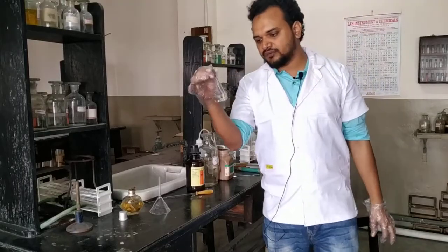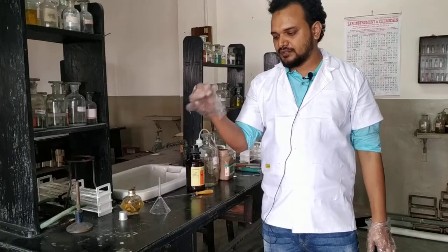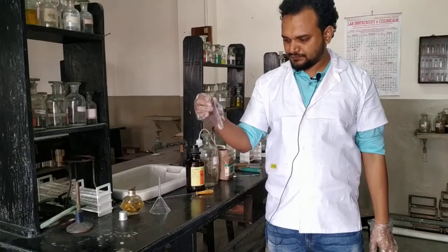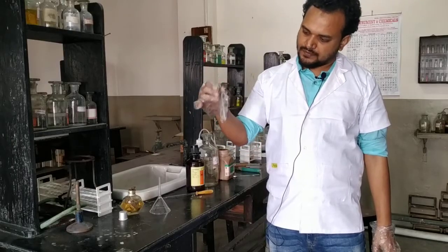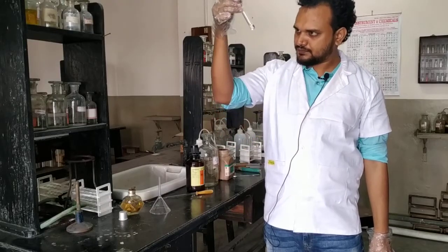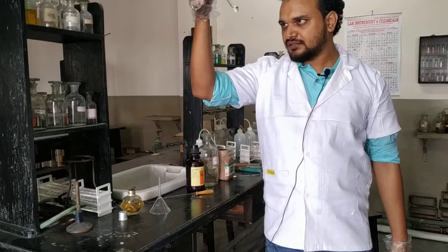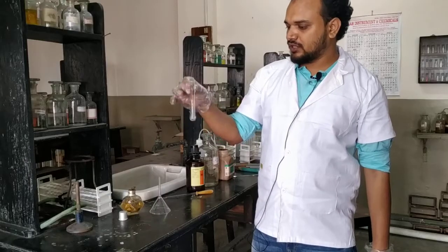The most delicate step of this test is the addition of H₂SO₄, which must be added very delicately. First, let us dissolve the resorcinol — shake it continuously. You can see the white crystal is still at the bottom, so keep patience and continue shaking until it is completely dissolved. Practical work is all about your patience.